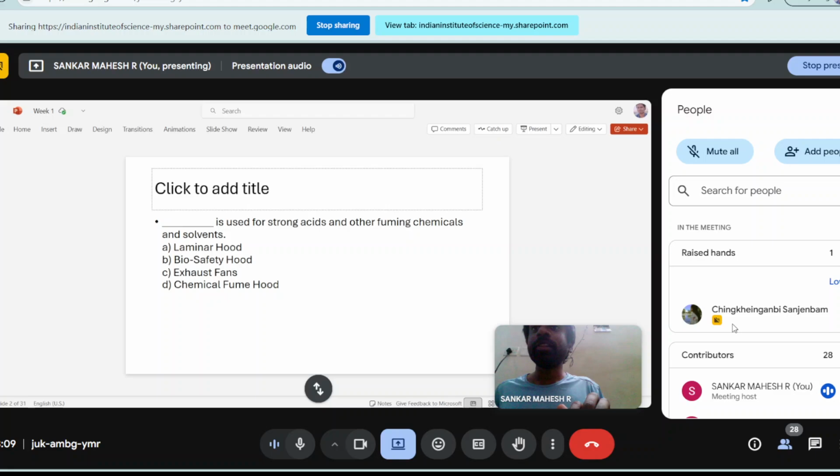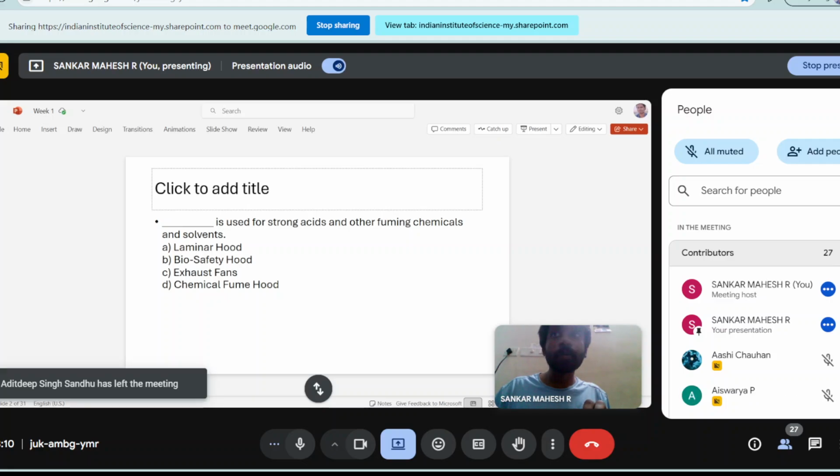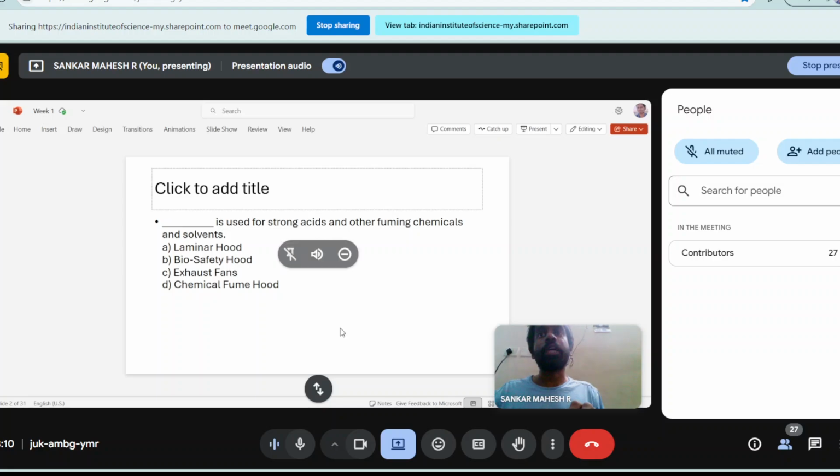Good. Anyone else? Do you want to talk about another incorrect option? Sanjanbam had actually mentioned two incorrect options, both laminar hood and biosafety hood. We'll come to the difference in the next slide. But there is at least one more incorrect option. Does anyone want to try? Yes, Sanjanbam, do you want to answer? Okay, I'll go to the answer. The other incorrect option is exhaust fan. So the right answer is actually chemical fume hood.